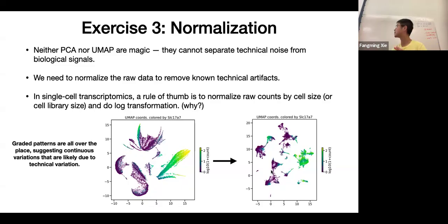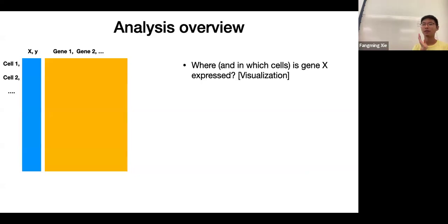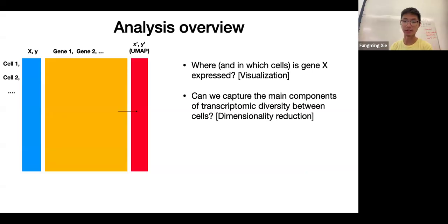So this code, you just take one line to do the normalization. I provided that to you already for yesterday's. So after UMAP, there's a normalization step. You can then reapply UMAP. Okay, so today let's move on to the last bit of analysis we're going to do together.